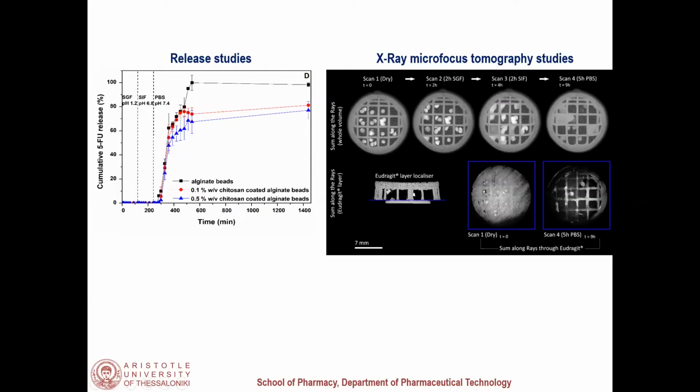And if we'd like to sum up the whole phenomenon, we could see it in these two images on the right, where we can see at the beginning how the bottom part of our formulation looked, and how it looked at the end. You can see that there is no barrier anymore. This mixture of hydrogels has already disappeared.